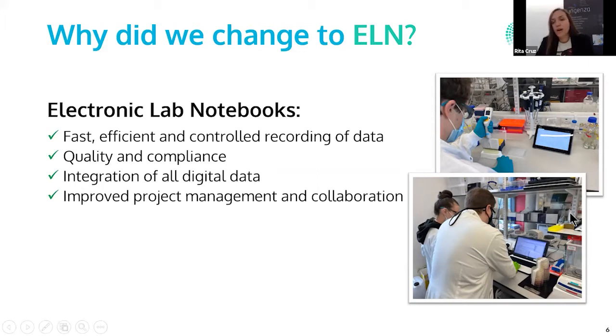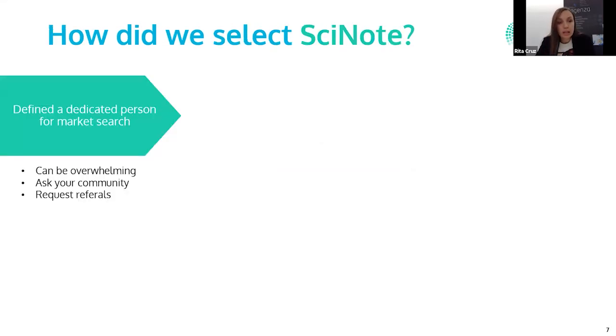So we also have laptops or desktops on the benches, and colleagues can input the data live as it's generated. So it was obvious that we wanted to change, and that would be a positive change.